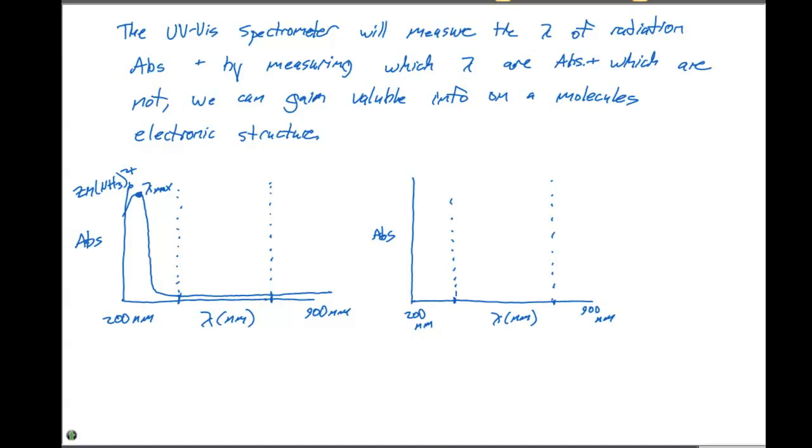The cobalt complex is a pink type of color. So what we see in cobalt and zinc is the same type of thing at the beginning, where we have a bump out in this end, then it tails down, and then we're going to see a bump like this in the visible portion of the spectrum. So we have a lambda max, or a large absorbance, that's going to happen in the visible portion of the spectrum.